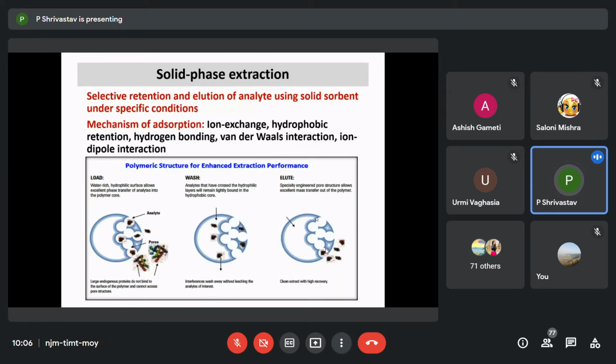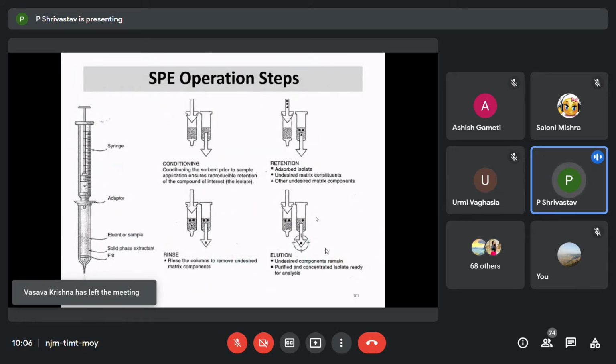The purpose remains the same. We need to elute the unwanted material or matrix, and we want to retain the analytes of interest. Once the matrix is removed, the analytes are eluted with strong solvents, and again the purity or efficiency obtained is much higher as compared to other techniques. Now these are certain steps, which one can say is a limitation associated with solid phase extraction.